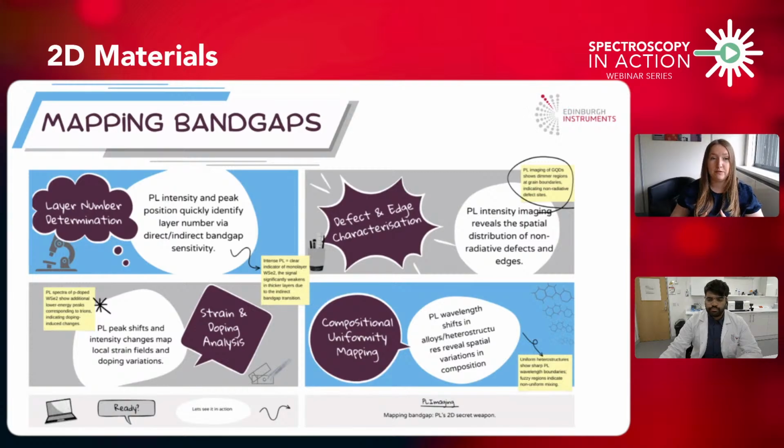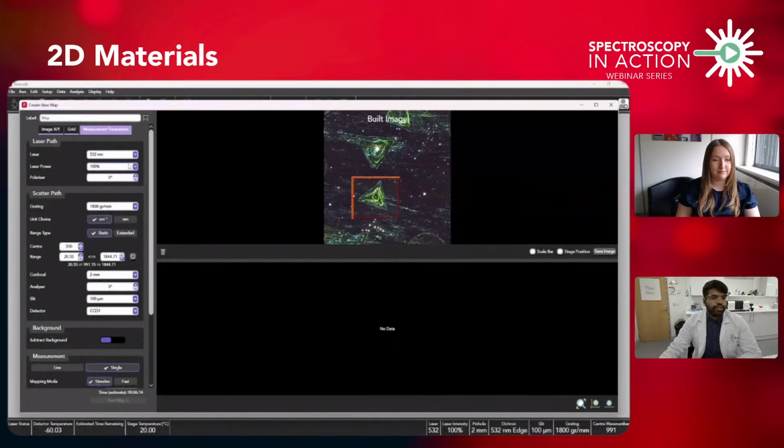So again, a quick whistle-stop tour of what PL can do for you. And now back to Nikesh to show how it can actually be analysed in the lab. Thanks, Angela. So let's start with the PL mapping.